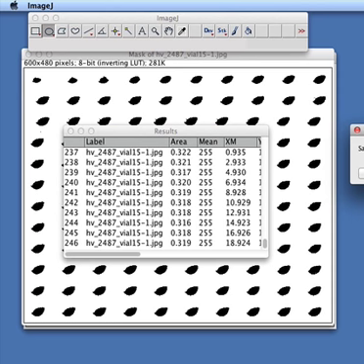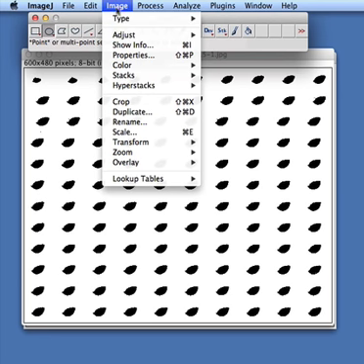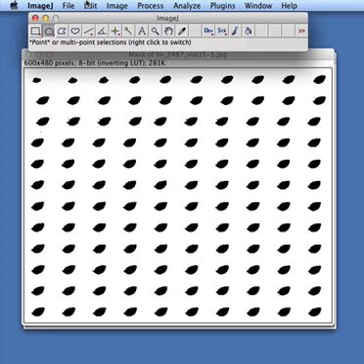So that's pretty much it. Read the instructions. When it tells you to do a command, it's talking about these commands up here. In the theory, look at shape analysis, shape factors, why it's important, and in the theory also go through and indicate how image analysis is performed, and that you're doing corrections and really selection of the information that's important.